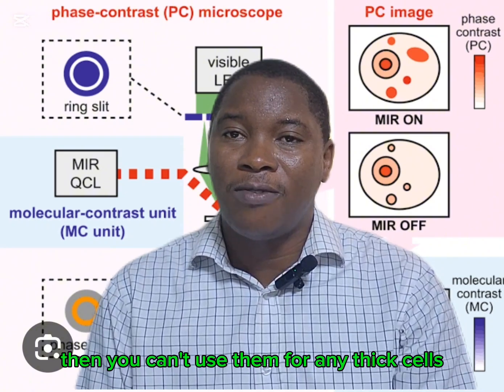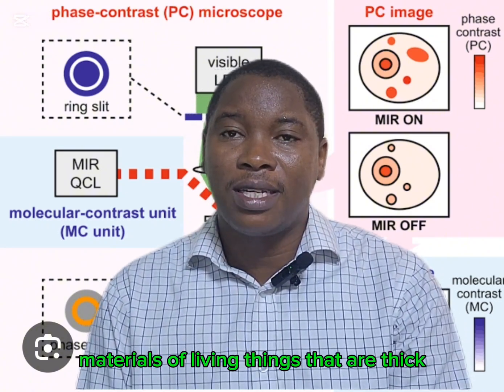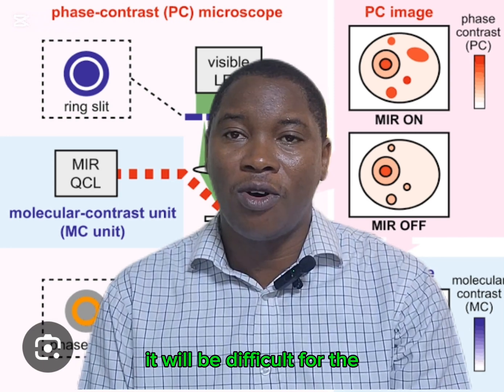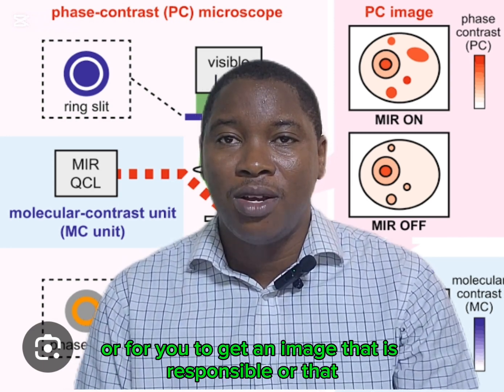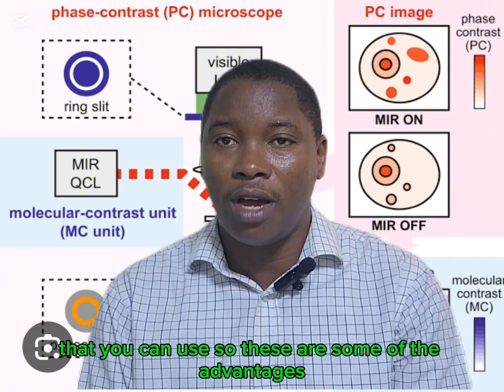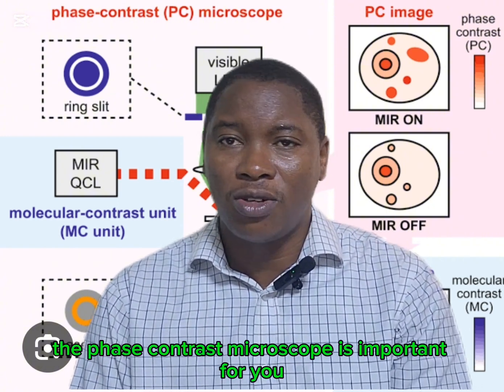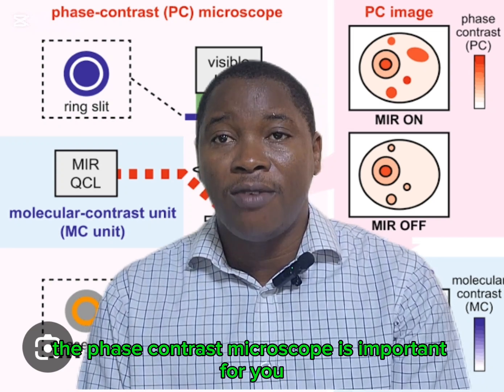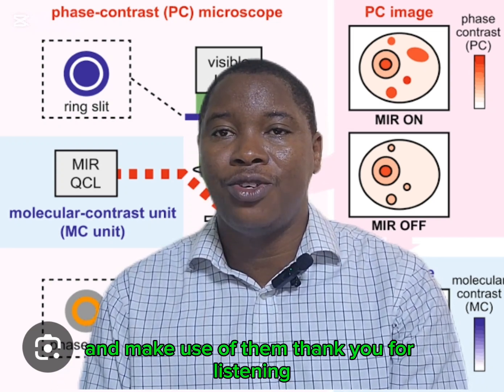Then you can't use them for any thick cells or thick materials. With materials of living things that are thick, it will be difficult for the light to flow through them and for you to get an image that is usable. So these are some of the disadvantages. And we must understand the phase contrast microscope is important to help you to see cells as they are living and make use of them.